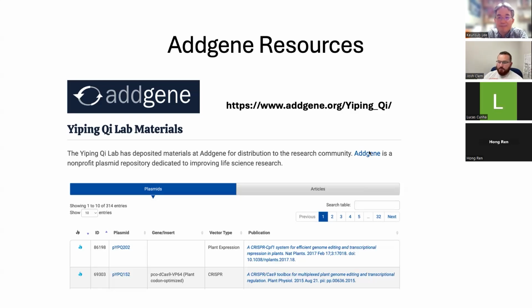I don't have much experience actually in these kinds of large multi-gene cassettes. I do a little bit, but what I will say in my experience, when I have multiple genes, I typically process them using a 2A peptide strategy.